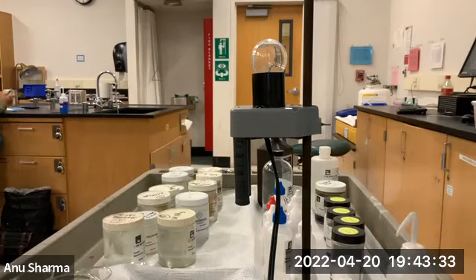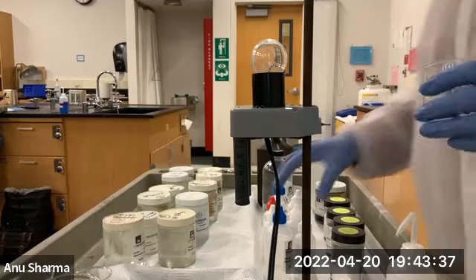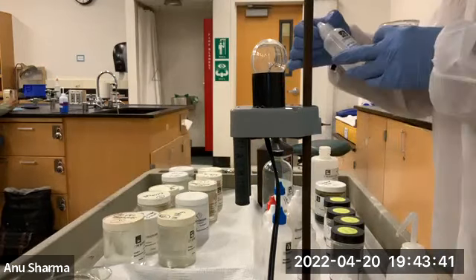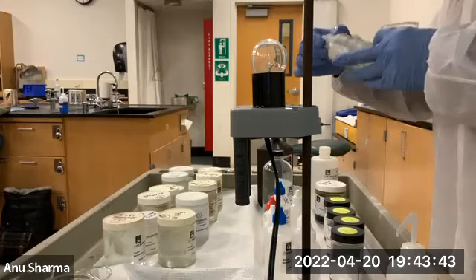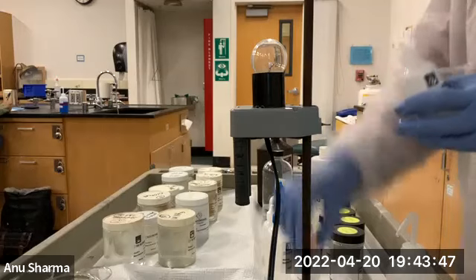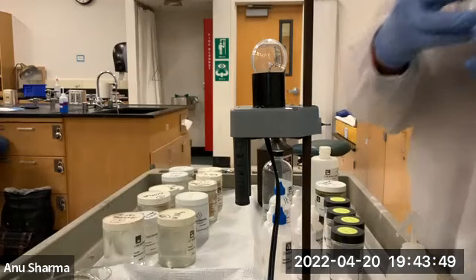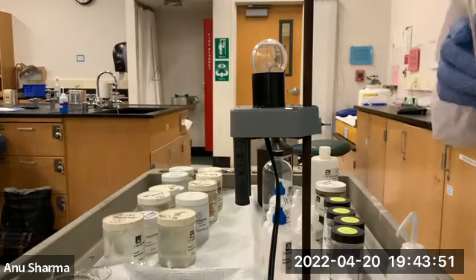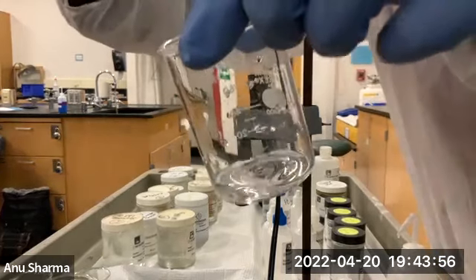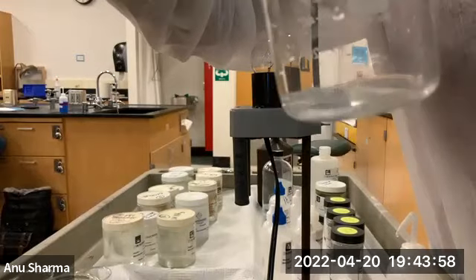Oh, sorry, we had to do the solubility in water. It is soluble in water. Let me just make it again. So here's water, and I'm adding acetone into it.